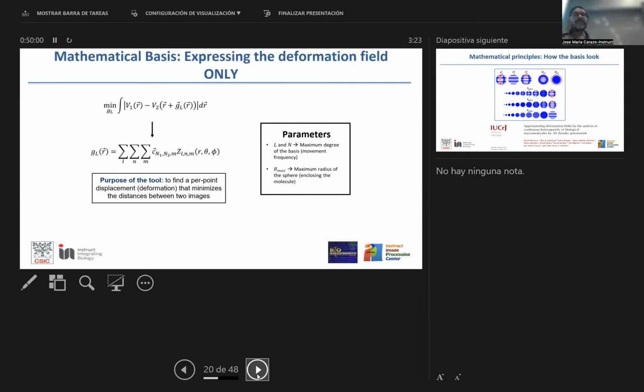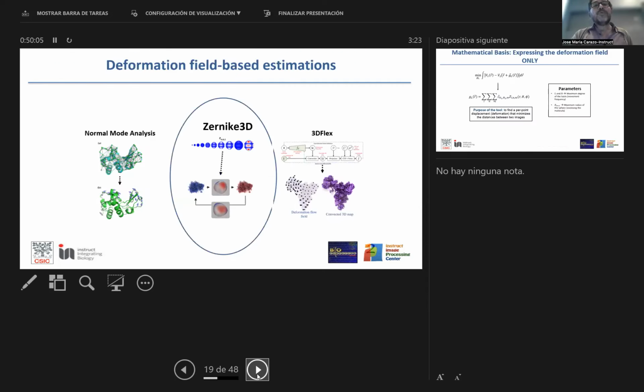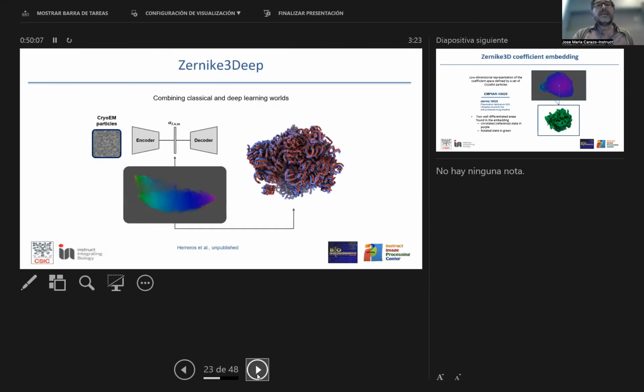And also, how do we do this in practice? I have been surprised by how we did it. It was with Powell optimization. We didn't want to go into gradients and things. But these optimizations are now completely replaced by an encoder-decoder. It's much faster, and the local minimum is probably closer to the global.